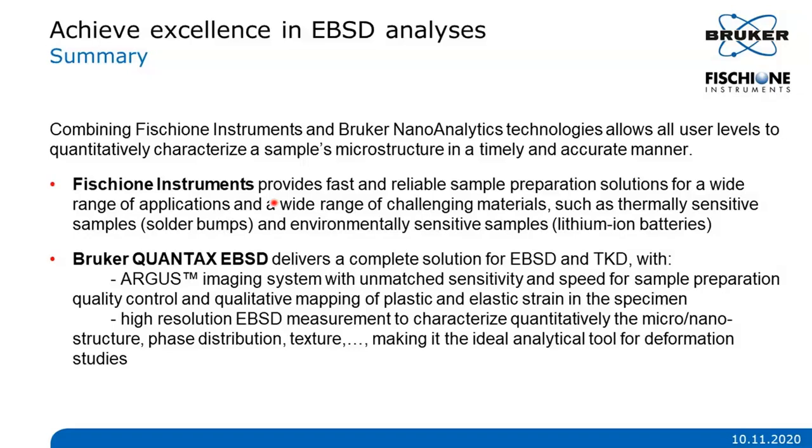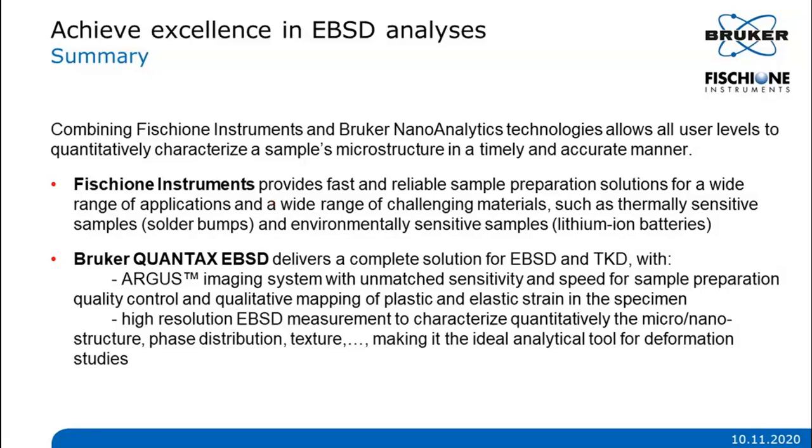Which software, what is the software? Oops. What is the software that we have used for the misorientation of the grain? So I think you referred to the kernel average misorientation maps. Let me go back to one example, maybe the austenite ones.